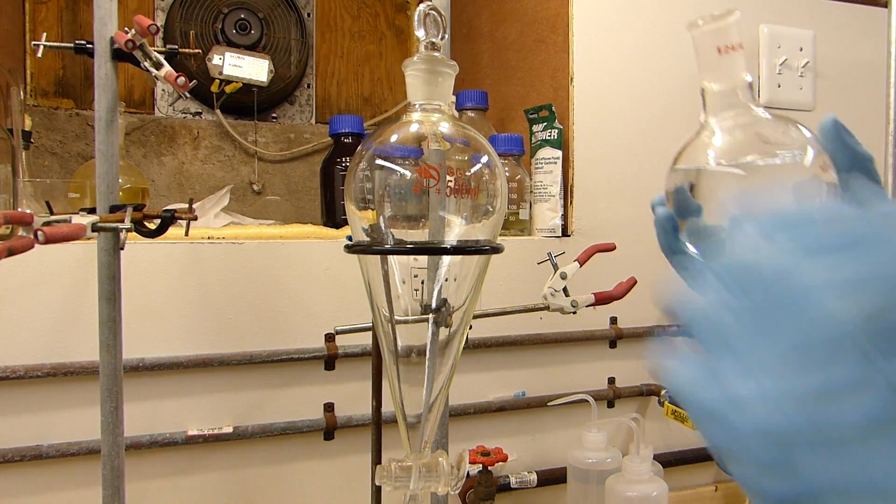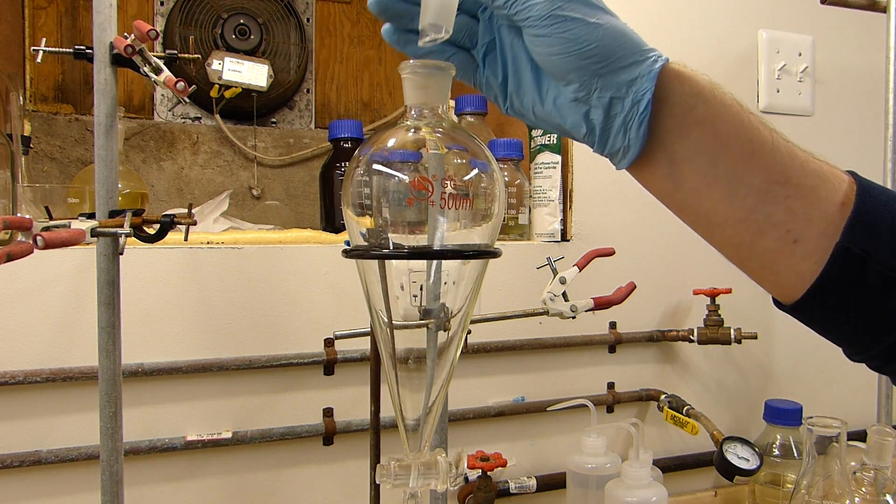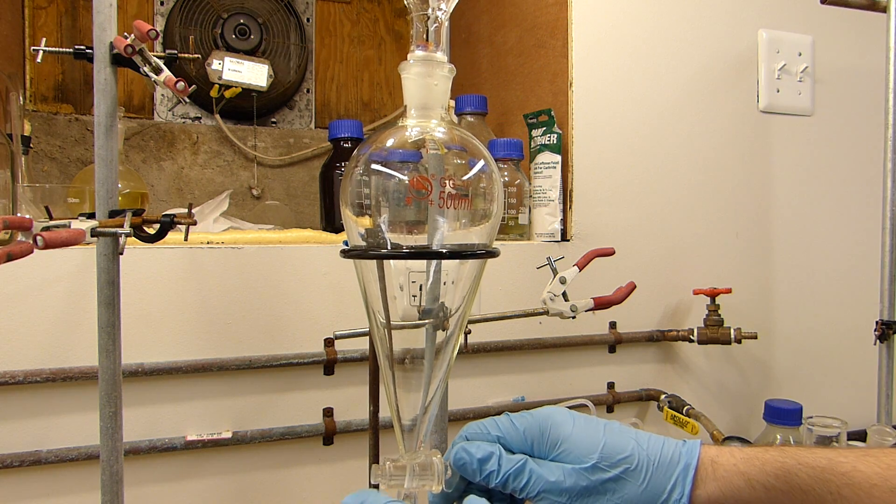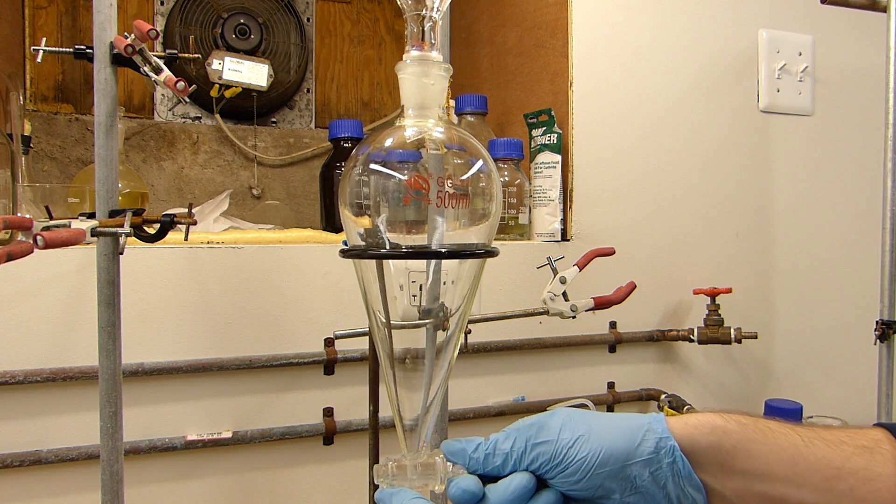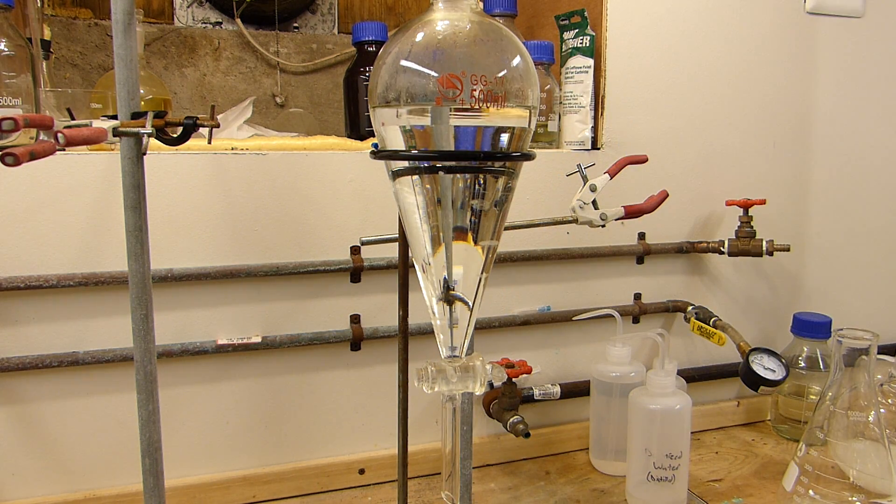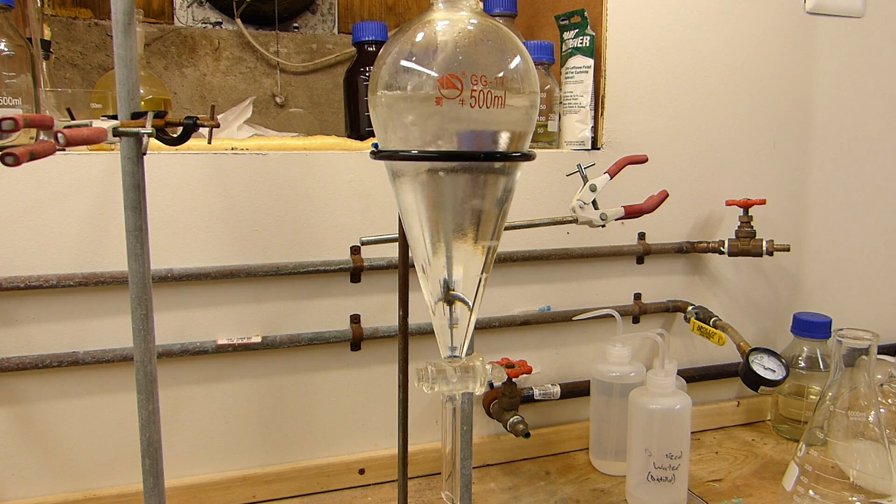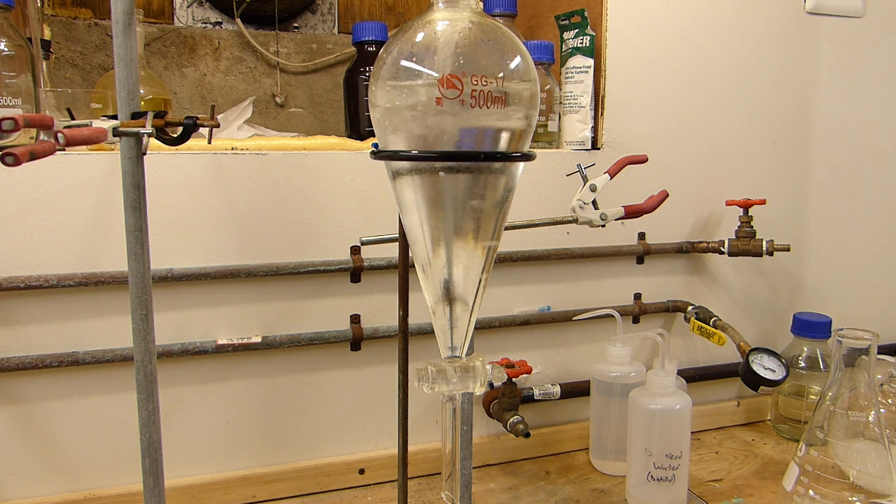So what I'm going to do essentially is just pour the dichloromethane into the funnel, making sure the stopcock is closed. Now I'll add a little bit of water and remember the water is going to act to absorb the methanol. So we'll get a good layer going there.